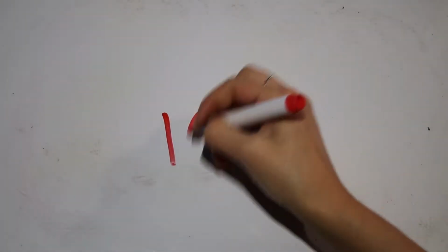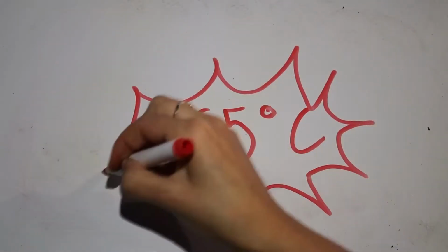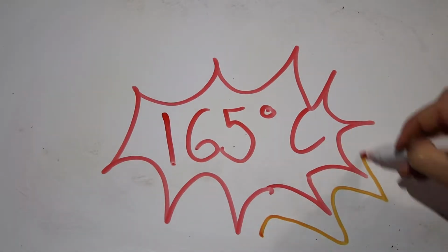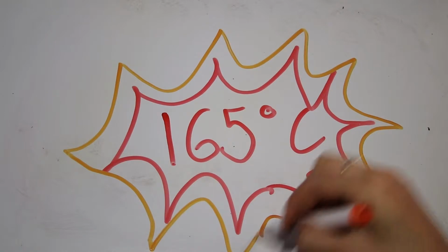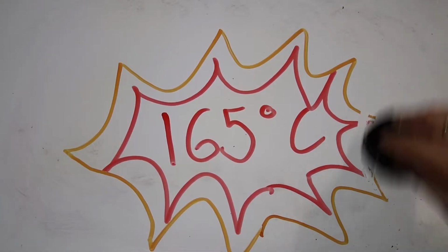The melting point apparatus will obviously get very hot when heating a substance to its melting point. You may have to keep heating until upwards of 165 degrees if you are given a certain substance out of the group. Be vigilant and give the apparatus the respect it requires. Stay safe during your practical. You probably have many more to come.